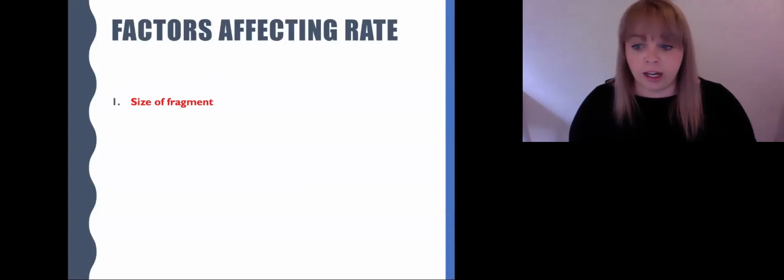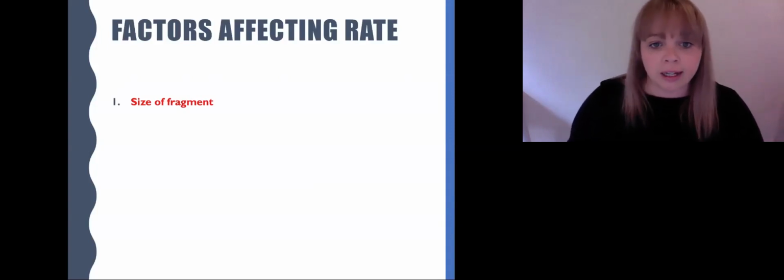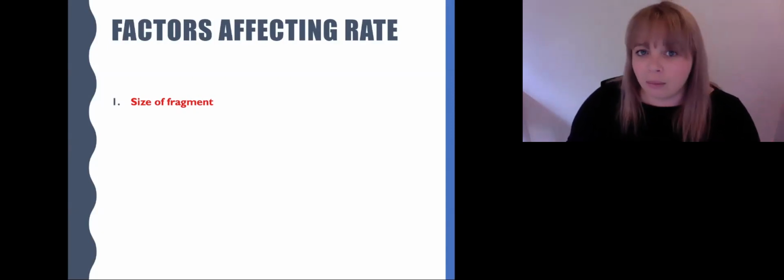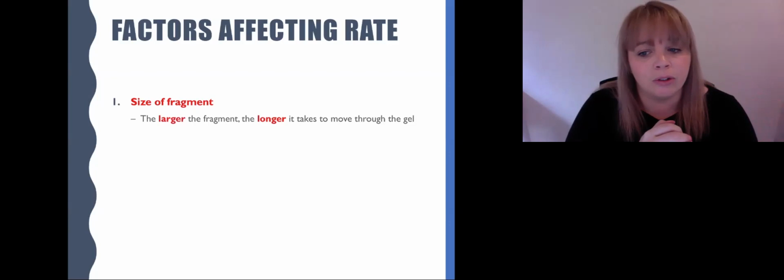So what we look at here, the first one, is I want you to have a relationship for each one of these. So stop, pause, think about what is the relationship between the size of the fragment and how fast it moves through the gel. I'm hoping you could come up with the fact that the larger the fragment is, the longer it takes to move through the gel.